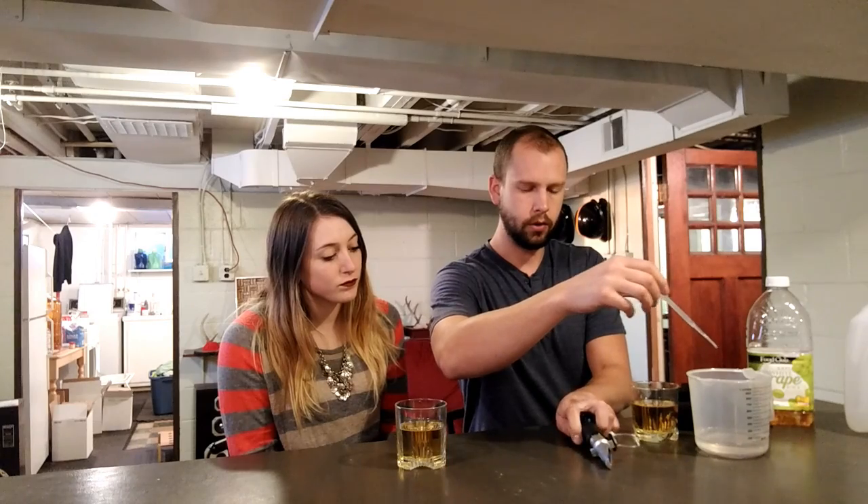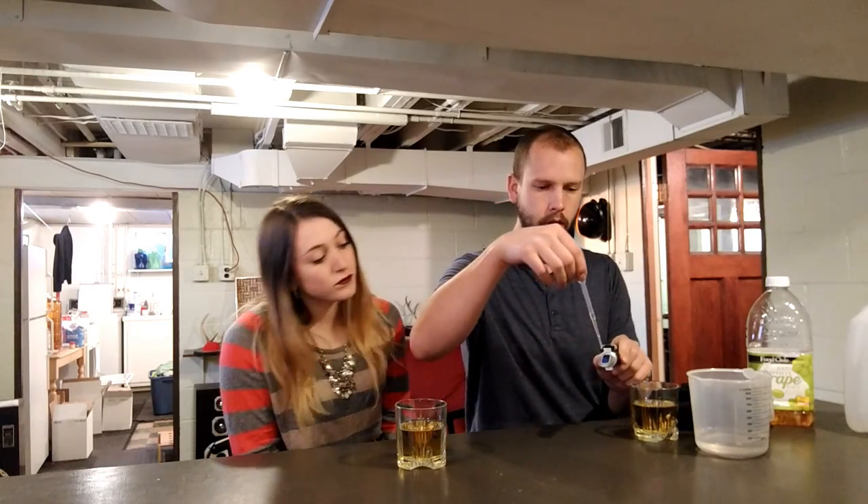It's from Advanced Optics Inc., and I think they're about 25 or $35. And these are really handy because you don't need a lot of juice to take a measurement. So you can go out and squeeze a grape into it and know how much sugar.